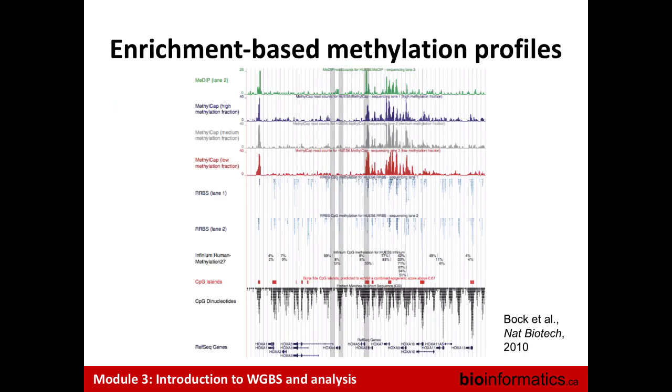So moving on to what the data looks like, which is going to help visualize and put this together. At the bottom, you have what we were looking at before: the CpGs, the CpG island, and the sparse microarray probes. Again, that's better now, but microarray probes are relatively sparse. You have data here from RRBS, and you see that you are getting a nice distribution of reads that follows quite nicely the distribution of CpGs in the genome. So you do get some representation there.